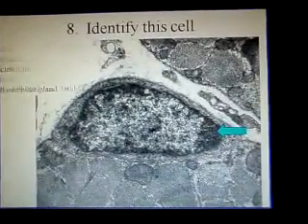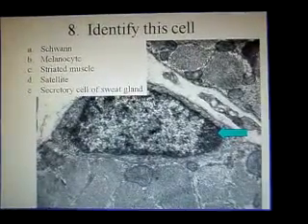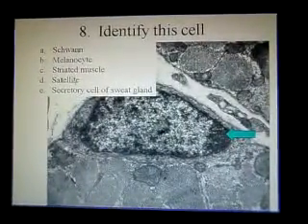Membrane. Separate this cell from that cell. These are myofibrils in cross-section. So you know it's a striated muscle. The nucleus belongs to a satellite cell.